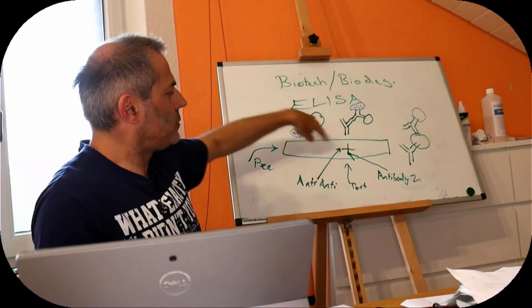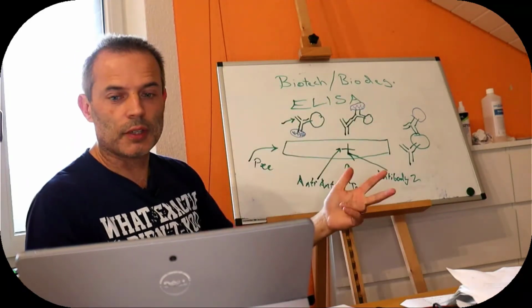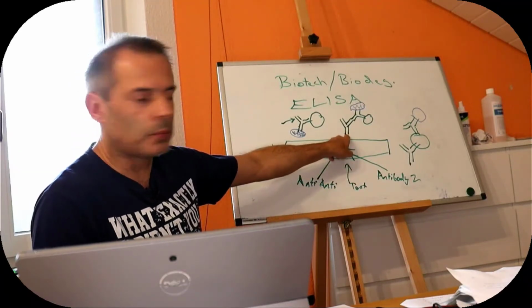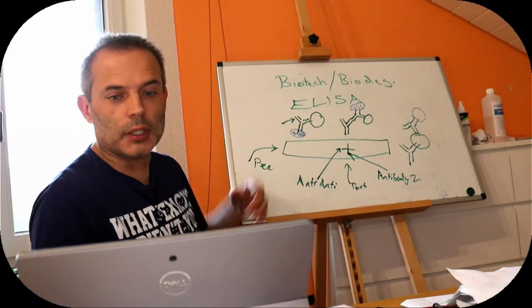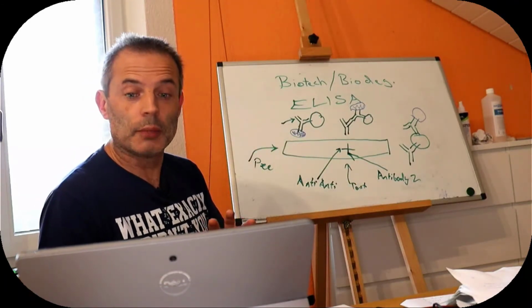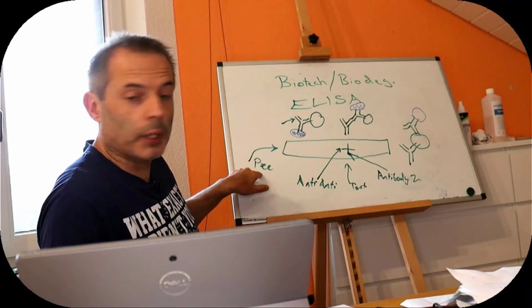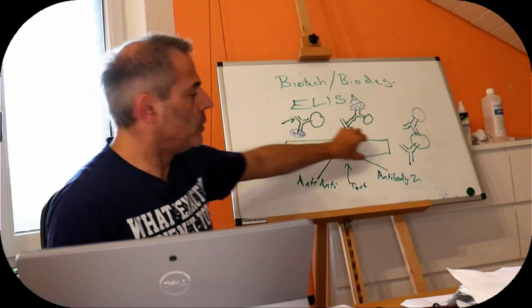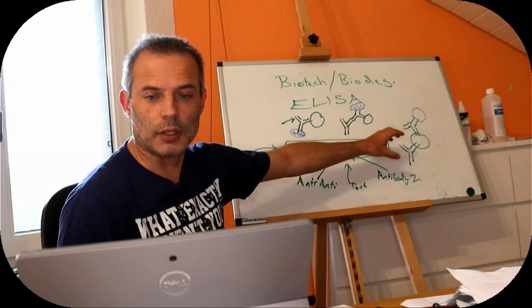So in this case, we've got 3 types of antibody. 2 of them are bound to the surface by this bottom group, and 1 of them is floating in the wee. The really cool thing about these is that the amount of pee that goes up them is fixed by the volume of the device.